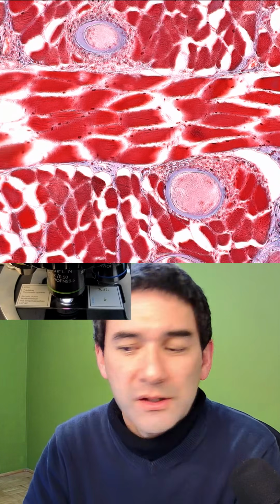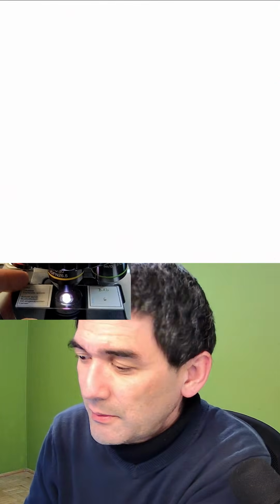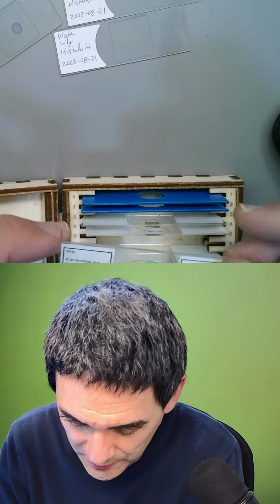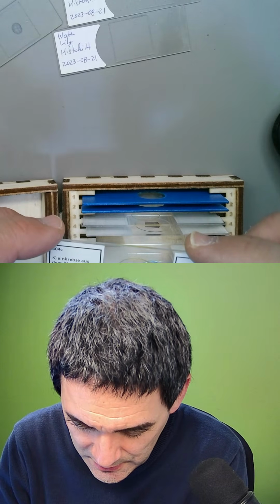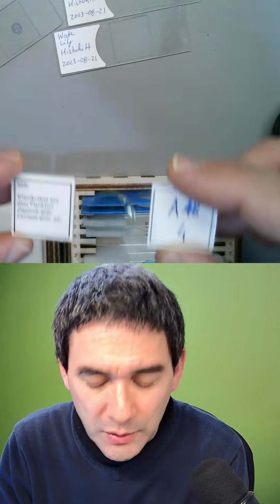So let's move on a little bit. Gee, this takes me longer than I anticipated, but it's fine. I do still have a couple of these. This is a nice one over here. What is this? Oh, I took out the wrong slide here. That's not one that I actually want.